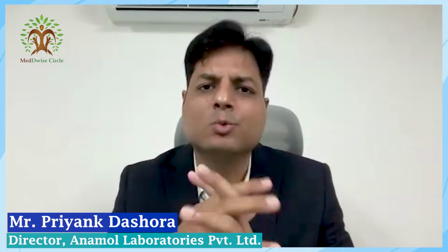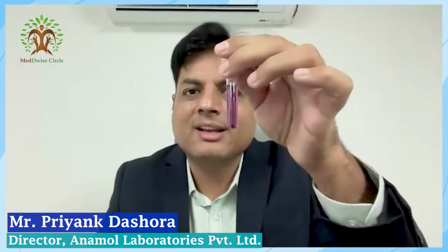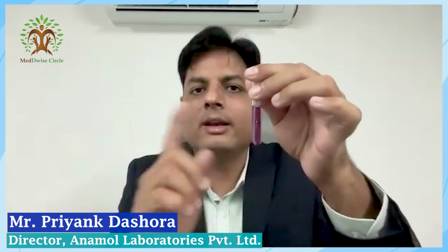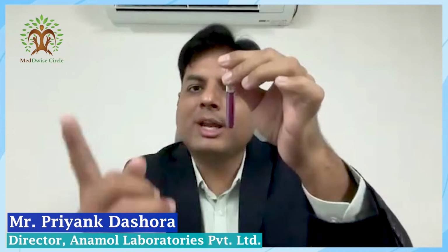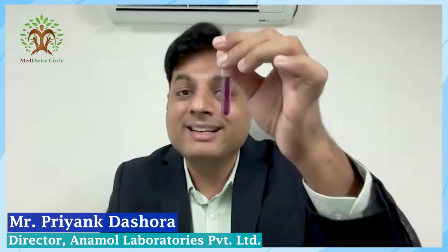Let us try to understand this one by one. Say, for example, I want to estimate the amount of glucose in a patient sample. What will I do? I will take a clean test tube, and in the test tube, I will add the glucose reagent. In this glucose reagent, I will add the patient sample, which is human serum. The human serum, along with the reagent, will react, and it will change the color, or form a new color. This color intensity depends on how much glucose was present in the human serum.